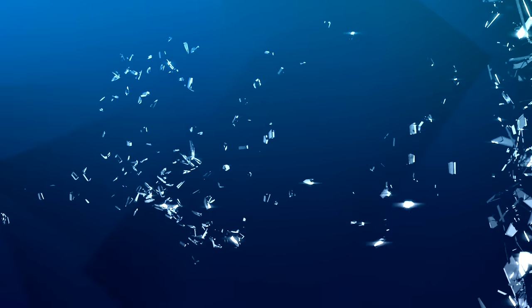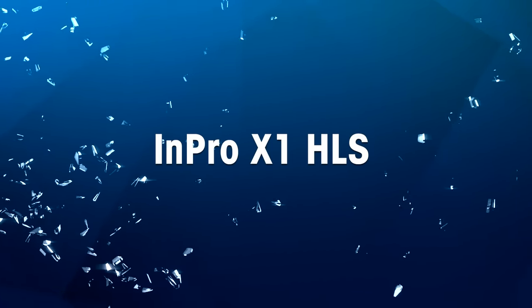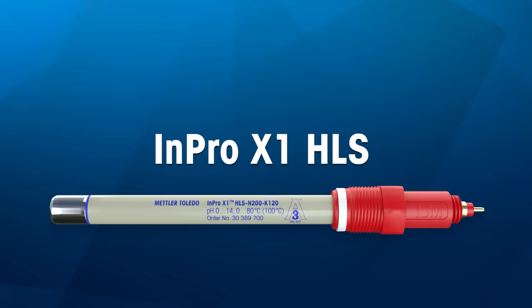InPro X1 HLS: the world's first food safe inline pH sensor that tolerates CIP.